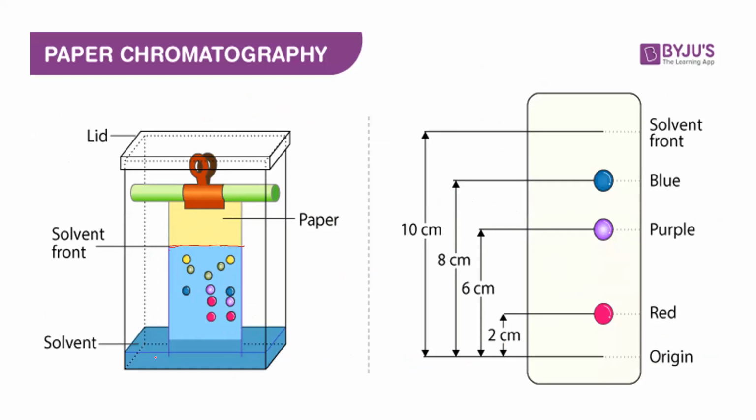It has also absorbed water, because our mixture was butanol, acetic acid, and water. The paper has an affinity to absorb water. So water runs through it, the paper becomes wet, and we now know that it is liquid. So the stationary phase also becomes liquid. The mobile phase is also liquid. Hence it becomes liquid chromatography.